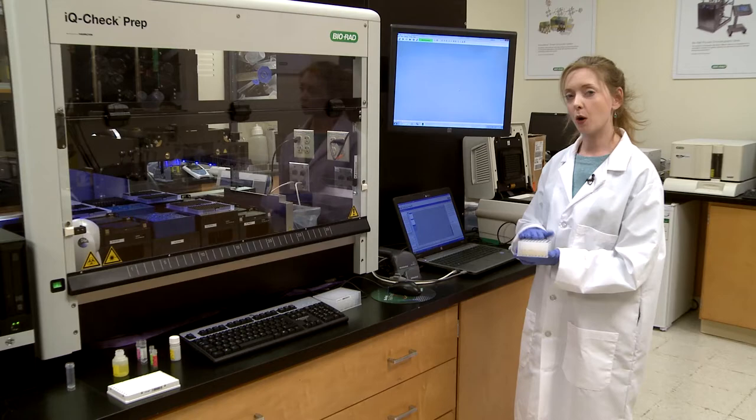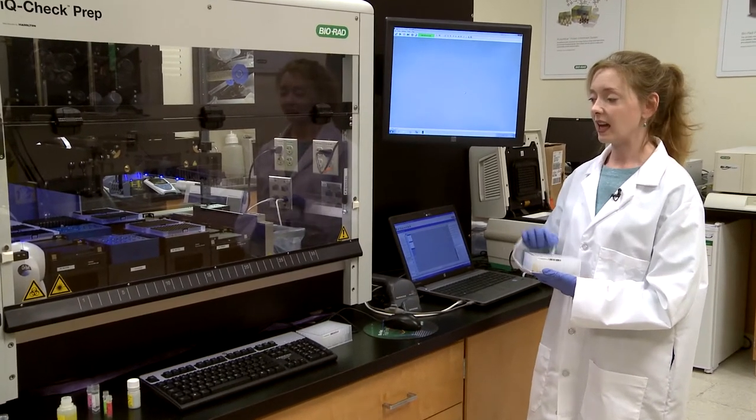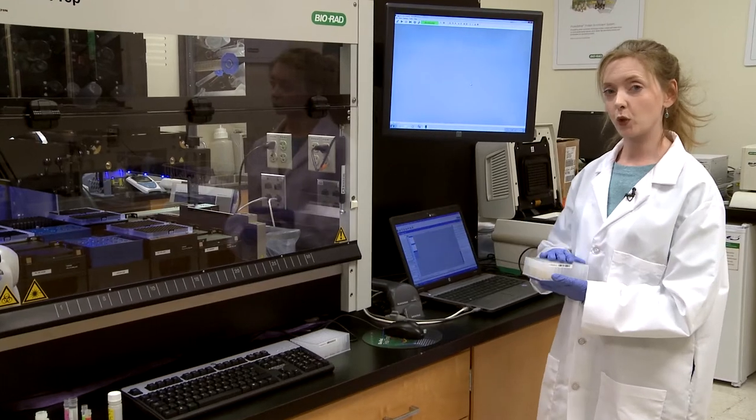Here is a deep well plate containing samples I want to test. You'll notice there's a handy barcode on the side that allows the robot to understand which plate it's working with.